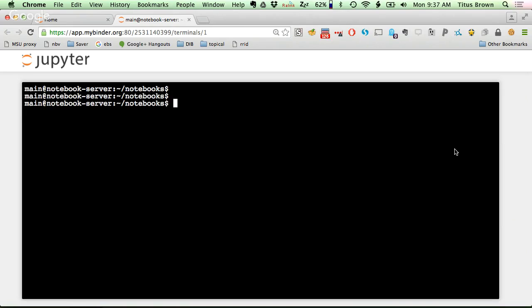And the command line here is wrapped in a web page, but basically this is a prompt that's on some computer somewhere else in the world. I don't actually know where it is. I think it's in the Pacific Northwest, but I could be wrong. And what we do is we type commands at this in order to tell this remote computer what to do. You don't have to actually figure out what those commands are in this workshop because we've provided them all in copy-paste. The goal here is to show you the process and to run you through the thinking around trimming.